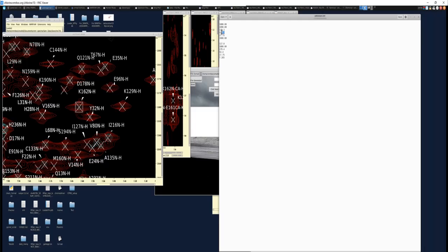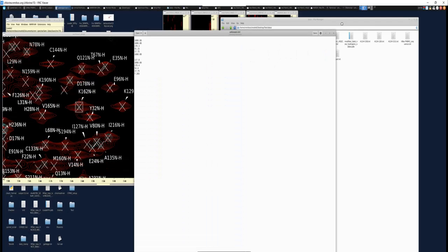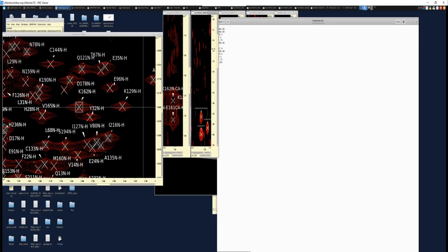Right, so first you start with the I-1, so C alpha at 58.2, and reload, okay. Now let's see if I can modify this. Yes, 58.2 for the C alpha.